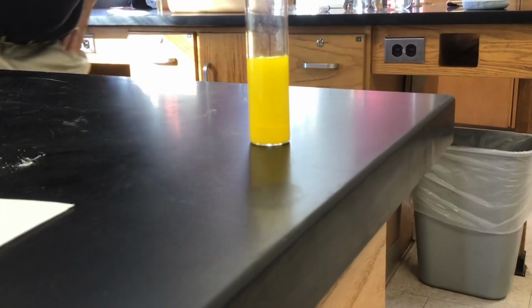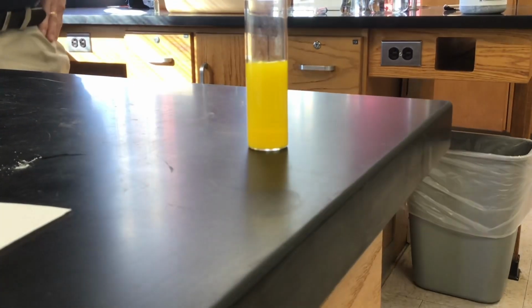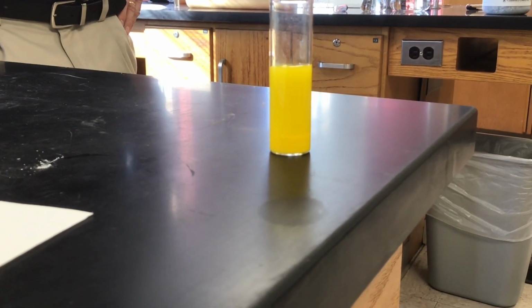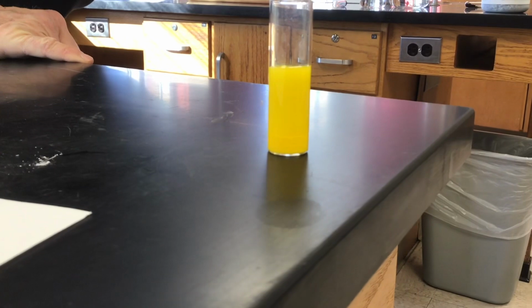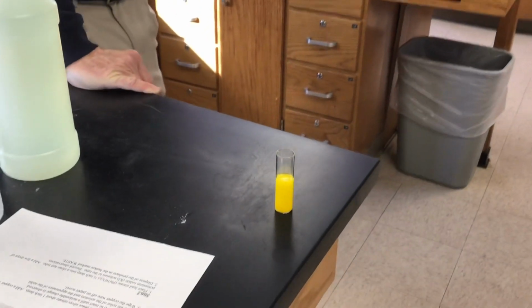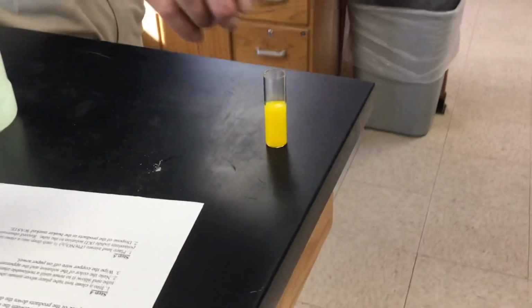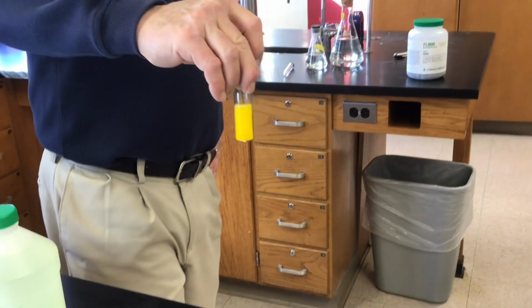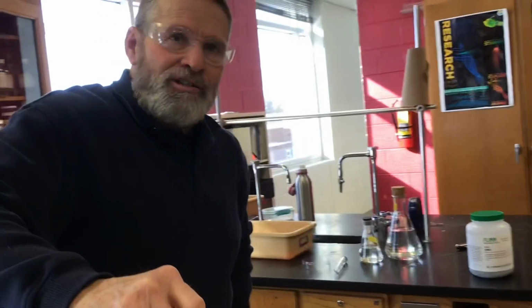Okay, well that's our five steps. I mean, you can tell that if we left this sit long enough, most of that yellow solid would fall to the bottom and pile up. The solid's more dense than the water around it, so it falls. It takes a while. We can let it sit here for a while, and maybe in class we can show you the final result. Okay, types of reactions.